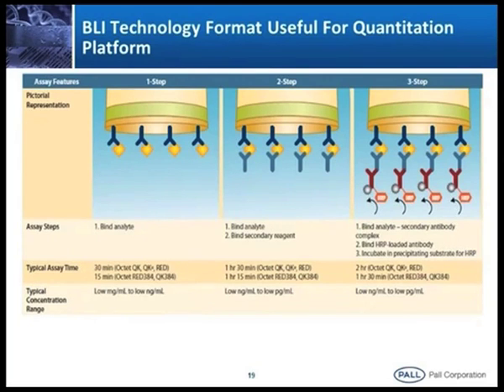If you look at the optical thickness, as in the principle I said, the more the optical thickness, the better the amplification. If you see, so many things are here, we can amplify the signal.